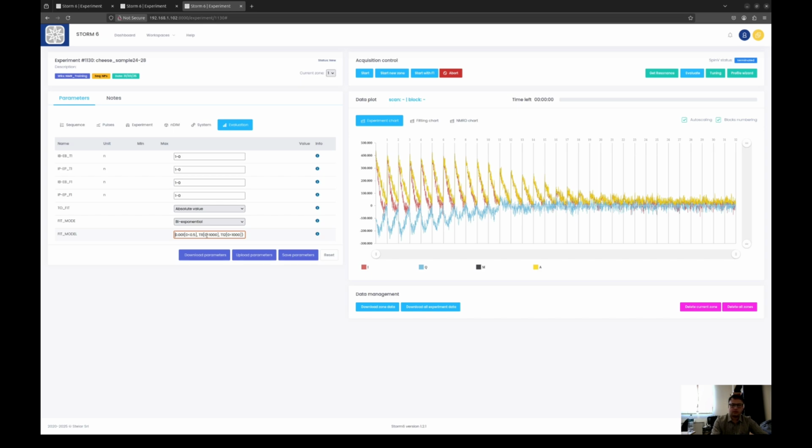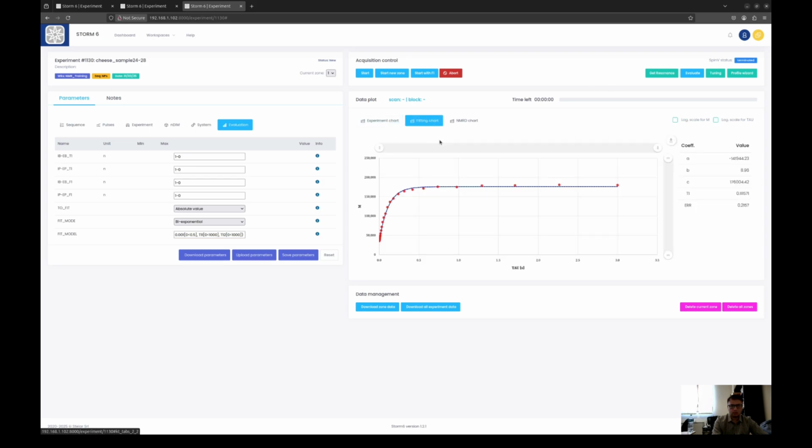So this is recommended to expert users, to verify the results based on what they see and the nature of the sample, because they already have some idea about how the sample should behave, and then they can tune it from here. So the experiment is already performed, so we do not have to perform it again. We just have to press evaluate. It will take the acquired data to the process, and then it will give us the multi-exponential values, which we will see now.